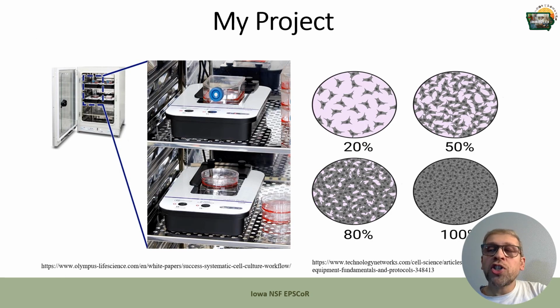Now, my project at ISU as a graduate student is to monitor cell growth during the cultivation process. Currently, there are some offline sampling techniques to monitor cells during the growth process.